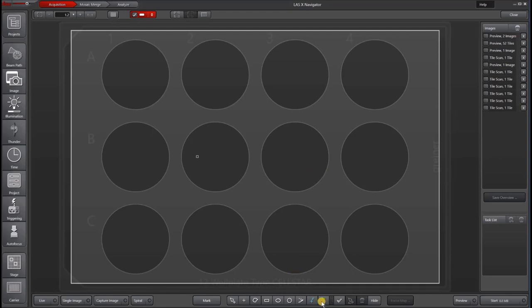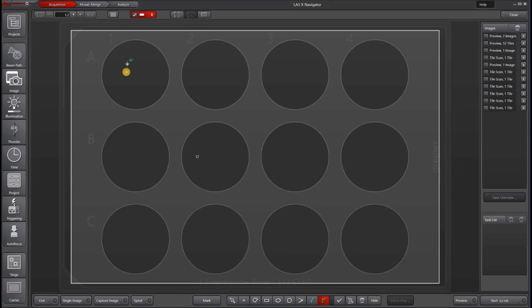The button is right next to your focus map point, it's called autofocus point. So instead of telling it to run it every other well, you can tell it the exact area that you want it to run the autofocus. So you can just think of it as a more customizable autofocus feature that isn't so regimented.